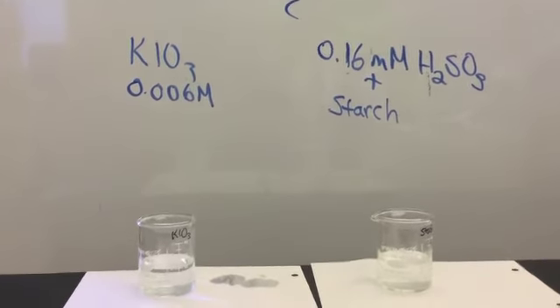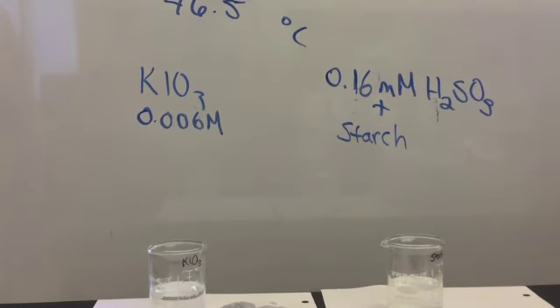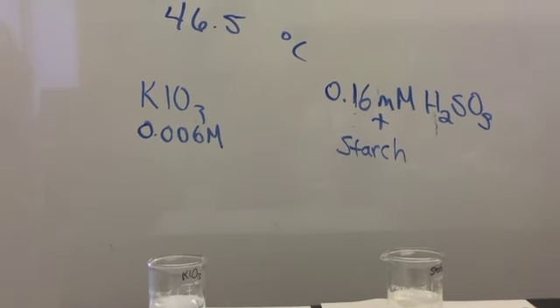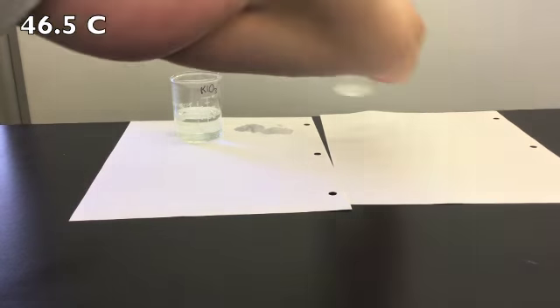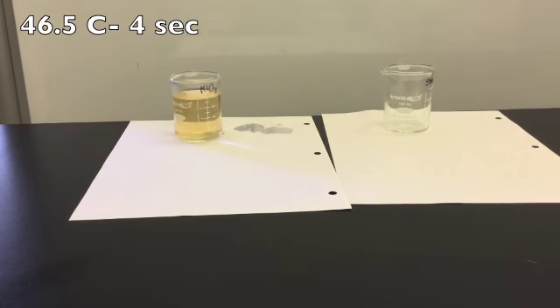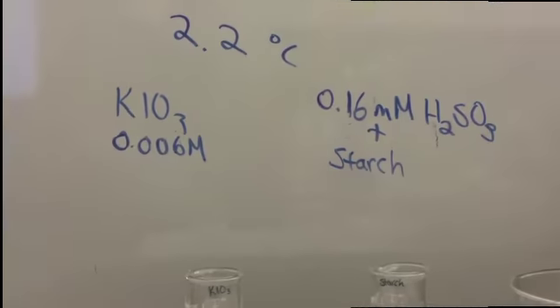Now let's look at the temperature effect on the rate of the reaction. The temperatures of these solutions are now 46.5 degrees Celsius. Of course, they're cooling a little bit, so it's going to be a little under that when I mix them. You'll notice that the temperature change caused the color change also to be different. This is because higher reaction conditions were distorting the shapes of some of the molecules.